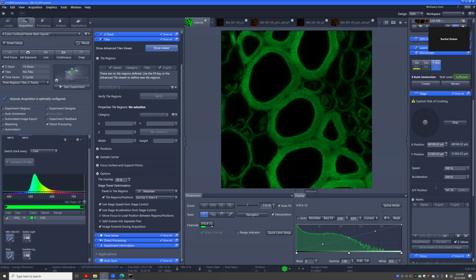If you see, especially at the top of your scan, a lot of wiggle, it means that it jumped there and your sample is still wiggling when it starts the scan. So one way to deal with that is bringing that speed down. So say you go 50% or 10%. Because this part of the scan is not a big part of it, right? It's just moving between the positions where it's actually scanning. That's usually taking the most time. But this makes it so that your sample doesn't get rocked as much when you're moving around.